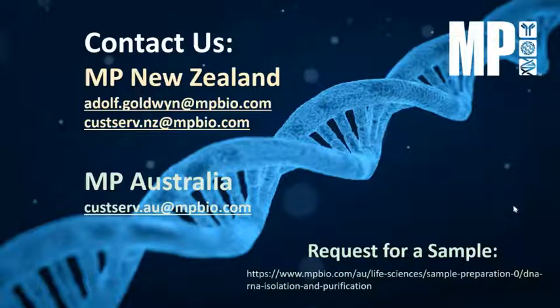And we have a question: why is yield lower for automation when using the beads? I think that's referring to the mag beads kits, Yongxing, in one of your slides that was comparing automation results to other results. Yeah, so I would comment that the use of automation is a more convenient and easy operation for large sample size.